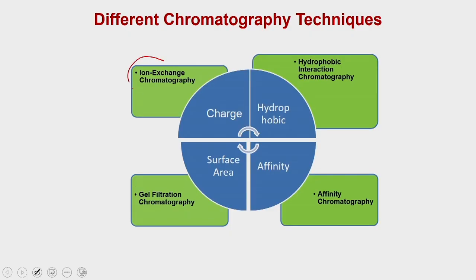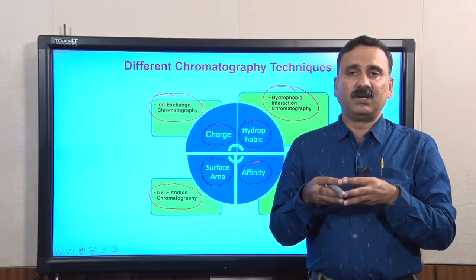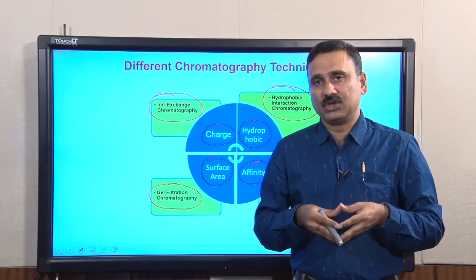What we have discussed about ion exchange chromatography is that it exploits the charge present on the protein. Then we talked about hydrophobic interaction chromatography, which exploits the hydrophobic patches present on the protein. Then we discussed affinity chromatography, which works on the exclusive affinity between receptor and ligand. And then we discussed gel filtration chromatography, which works on the surface area of a particular protein, and surface area is directly proportional to the molecular weight of that protein, as long as we are considering that all these proteins are globular in nature.